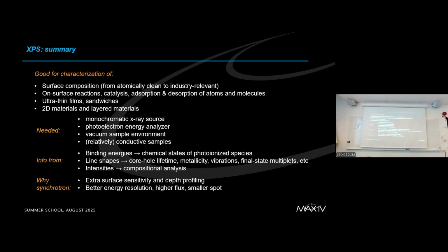And then after measuring the spectrum from your sample, we just shift to this reference sample, and without changing anything on the setup, with the same photon energy and same settings of the analyzer, we measure a spectrum from this reference. And then we know exactly what the kinetic energy is, what the photon energy is. I think we will discuss it more in the practical session of XPS.